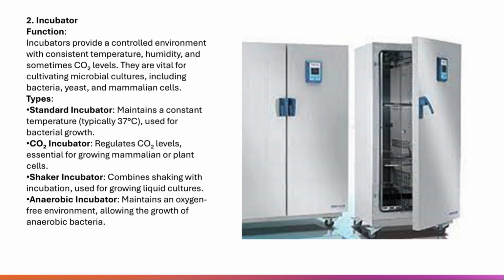Shaker incubator. A shaker incubator combines two key features. It provides the right temperature for growth, but also shakes the cultures. This makes it perfect for growing liquid cultures, like bacterial or yeast suspensions, ensuring that the microbes stay well mixed and have even access to nutrients.